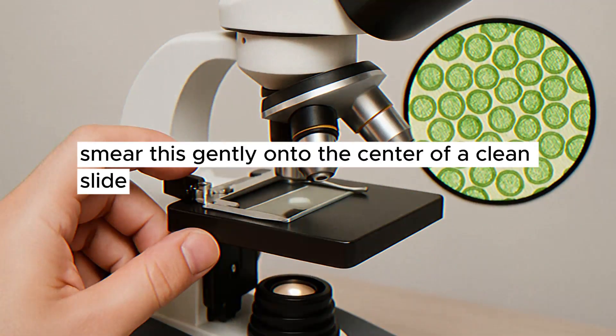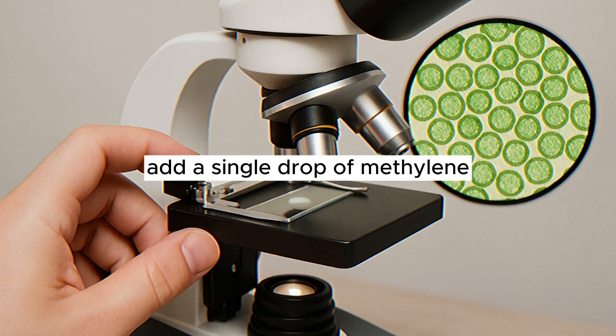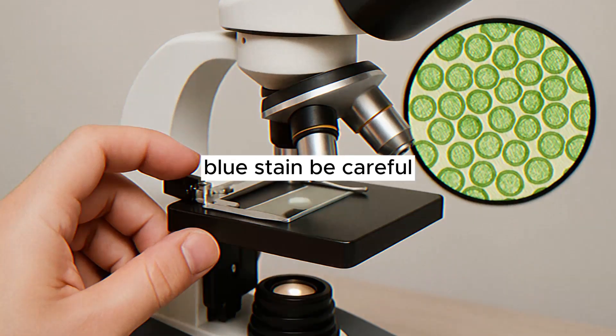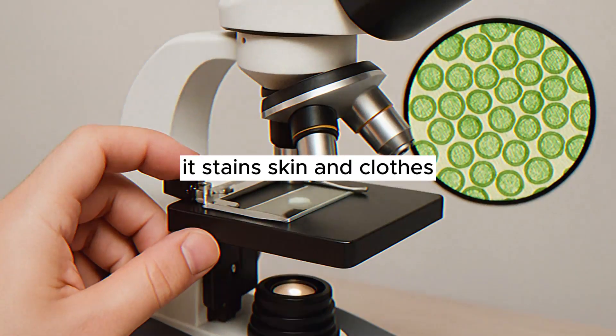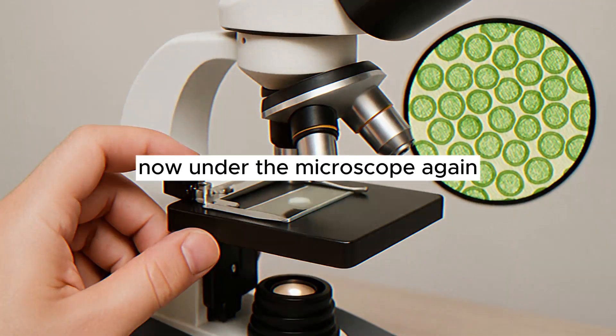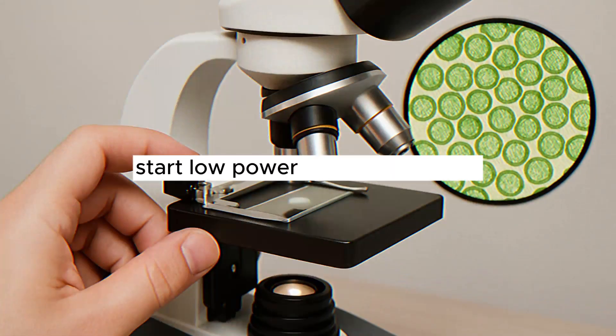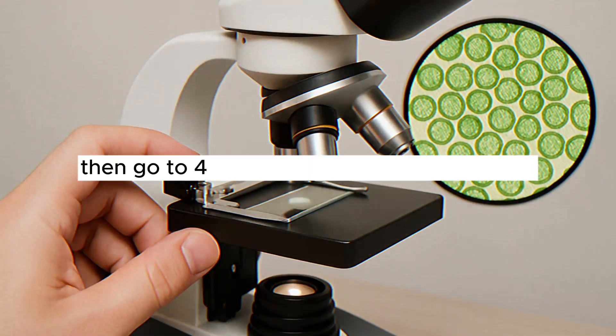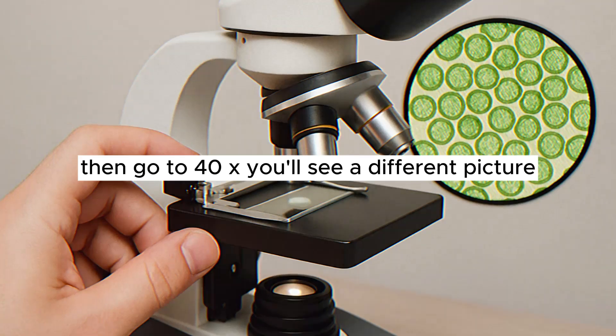You'll get some clear, gooey stuff that's mucus containing your cheek cells. Smear this gently onto the center of a clean slide. Add a single drop of methylene blue stain. Be careful, it stains skin and clothes. Then, carefully lower a cover slip on top. Now, under the microscope, again, start low power to find the smear, then go to 40x, you'll see a different picture.